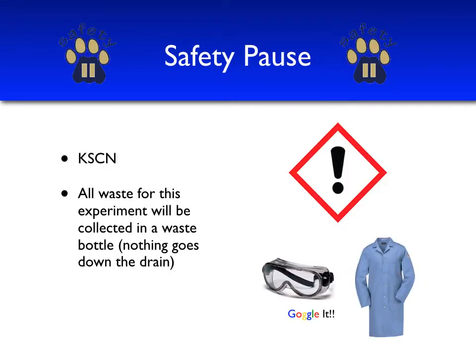For today's safety pause, we note the hazards associated with potassium thiocyanate, or KSCN. KSCN poses a hazard when mixed with other chemicals, such as acids, where it can end up producing a toxic gas. Therefore, care should be taken when using KSCN. For this lab, all waste will be collected in a special waste bottle. Nothing will be poured down the drain. And as always, we want to make sure that we goggle up and wear our flame-resistant lab coats.